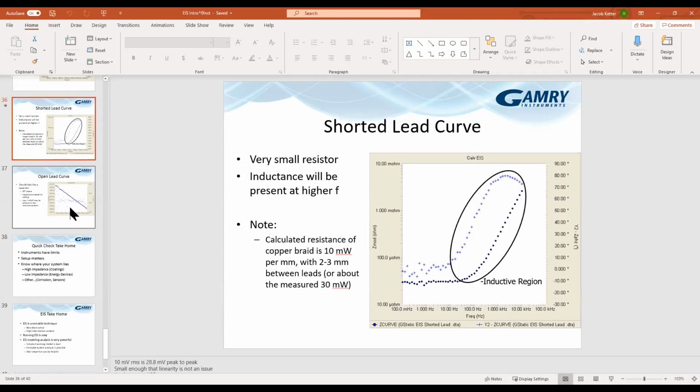One is it drives you to nonlinear response, and the other is it can potentially, depending on the electrode and things like that, cause damage to the electrode itself, whether that's accelerating corrosion too far, tearing off surface bound species, or, for things like microelectrodes, actually etching them away. So potentiostatic EIS is safer. Galvanostatic is mostly used when you need to measure very, very low impedances, where if you apply a 1 millivolt signal, you're going to get more current than the system can provide.